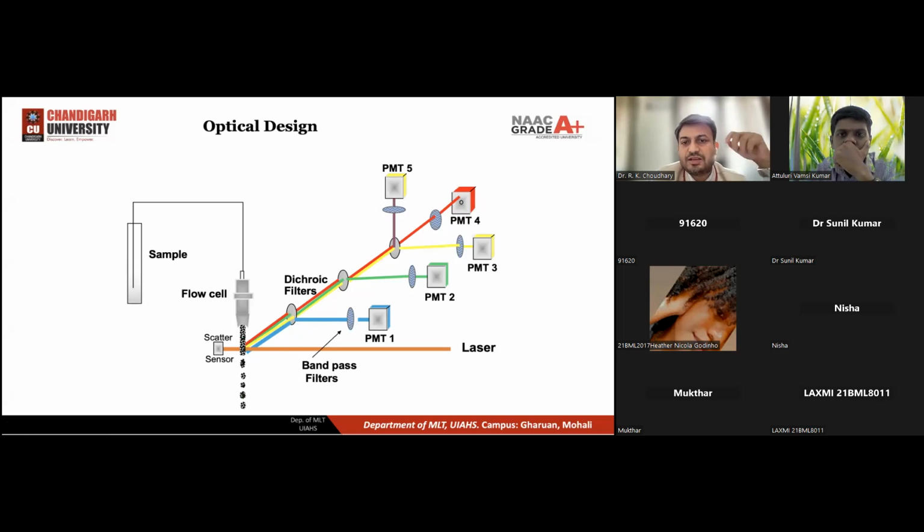Through the filters, two colors pass through, and then they detect each individual area. So one detects, and then gives you, suppose, RBC, WBC, platelets, or something different. If I am talking about stem cells, then CD34, CD45, they are different, and based on that they detect and then make the graph and the amount. During the analysis, I can show you, the machine already gives how many cells are present.